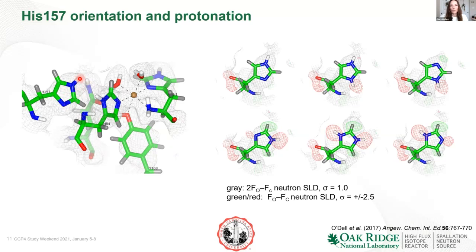But here with neutron scattering, we were able to unambiguously determine that this histidine was singly protonated at the N epsilon position.